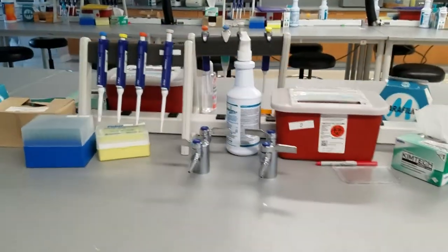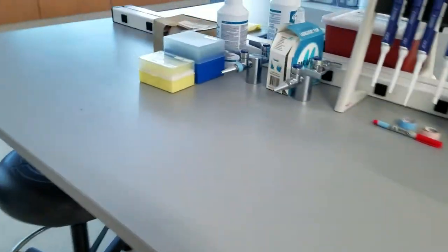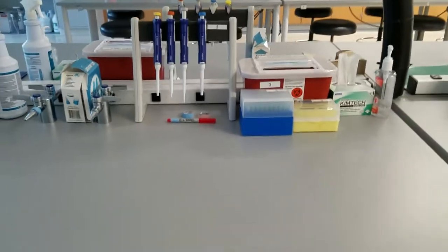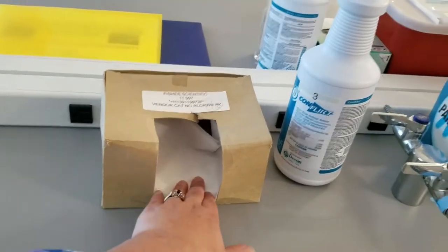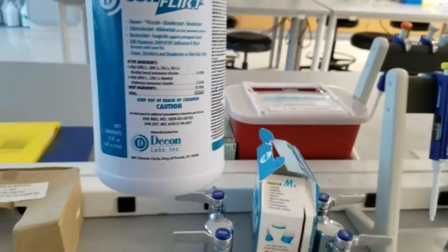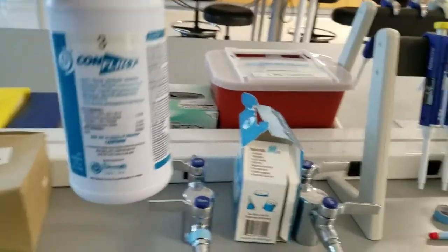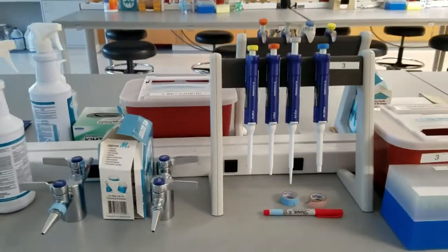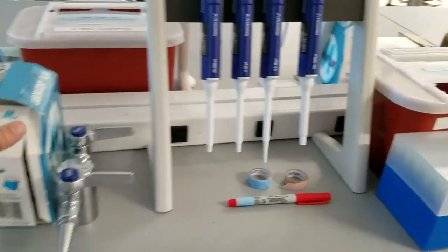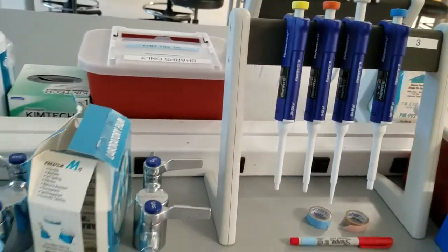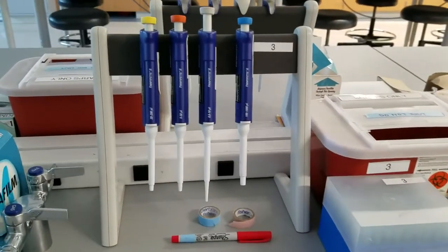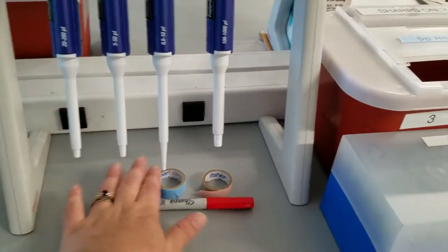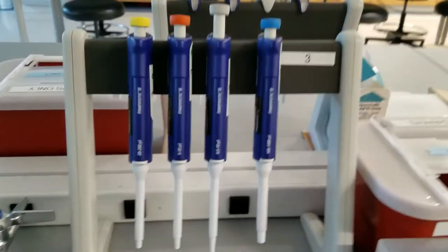Let me quickly go through what our stations look like. The stations in our lab are going to be organized in a particular way. Each pair has a station number associated with them - we are on station 3 right now. They will have some lens paper to clean the lenses of the microscope or the slides if they get dirty. They have a Conflikt bottle which is basically a virucide, a disinfectant, a deodorizer, and a cleaner that we use to disinfect our surfaces anytime we need to. We have parafilm that we use to seal our reactions and sometimes also use for other incubations. Everyone is always given a pen, a marker, and some tape to use as they need.